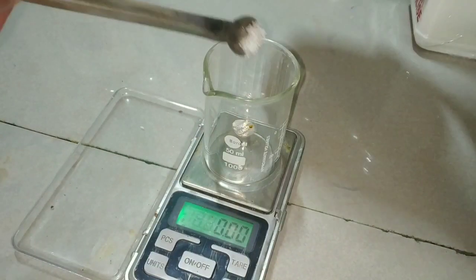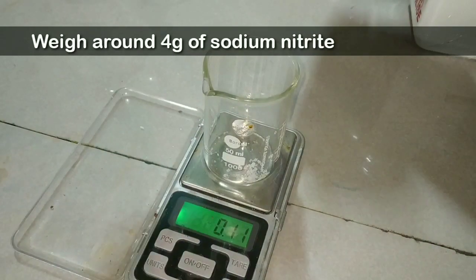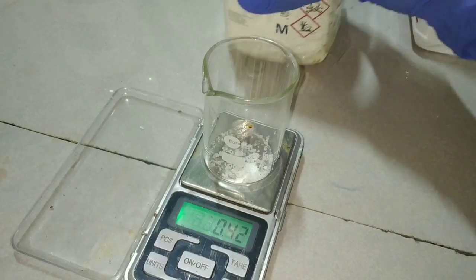The next step is to weigh 4 grams of sodium nitrite — that is NaNO₂, and not NaNO₃, which is sodium nitrate.